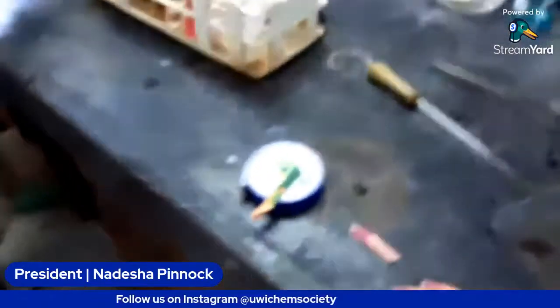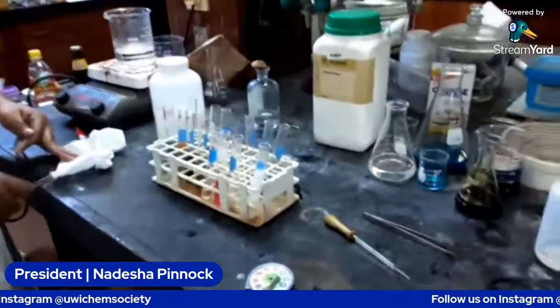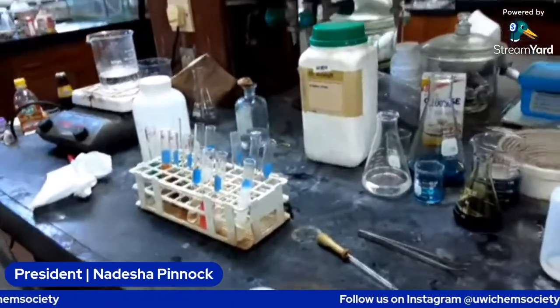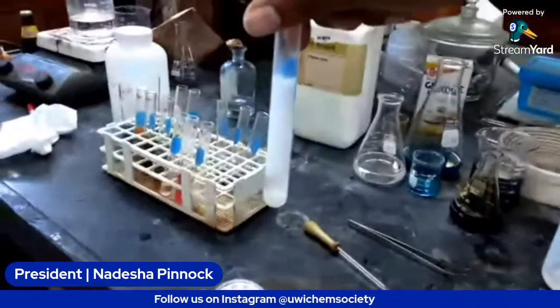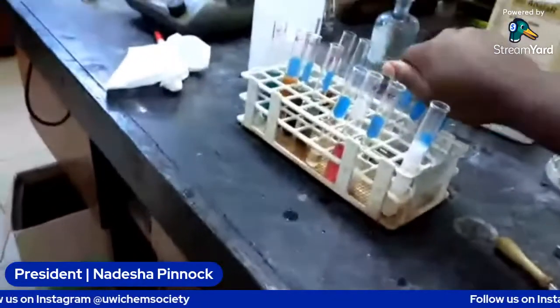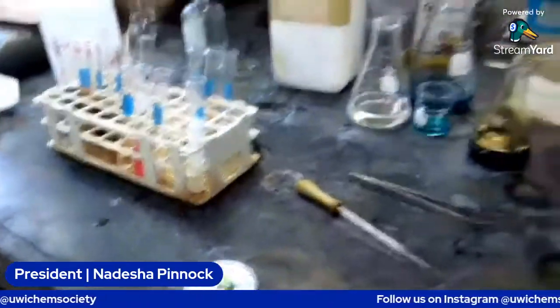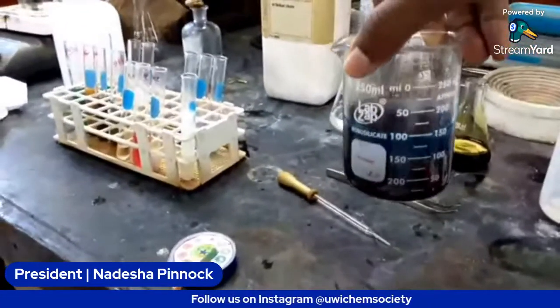So again, a recap before we go to questions. We did the lipid emulsion test. We did the Biuret test, which consists of copper sulfate and sodium hydroxide.